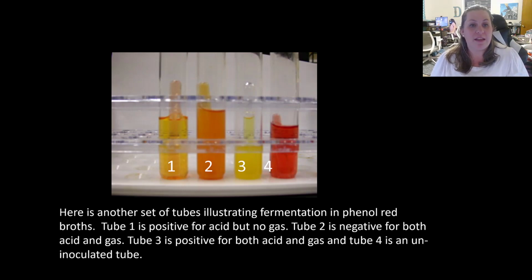And then tube 4 is uninoculated. It's not positive or negative. So you can see here that it doesn't have anything in it. It's just that original red color. So this is the carbohydrate fermentation.